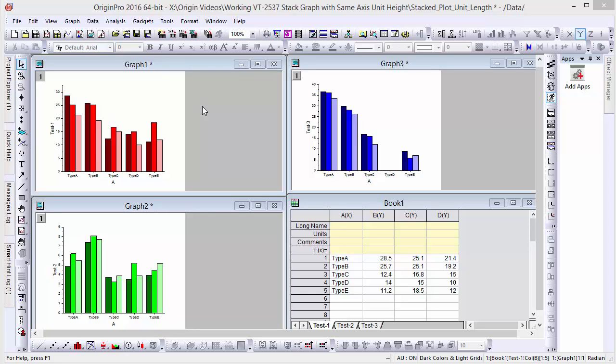Hi, this is Ken from OriginLab. In this short video, we'll be going over how to make stacked graphs with uniform axis unit lengths.